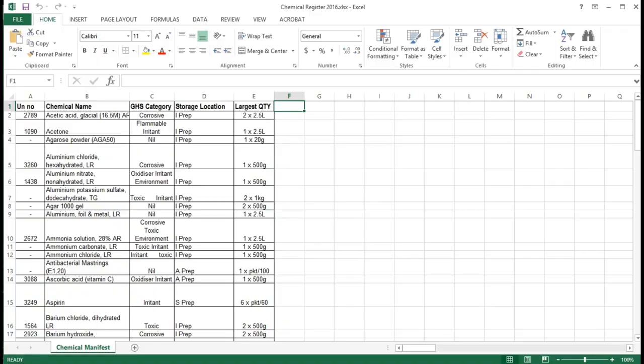I've just opened up the chemical register that we created in part two of this webinar. What we're going to do is copy the chemical manifest sheet and change that into a hazardous chemical register.